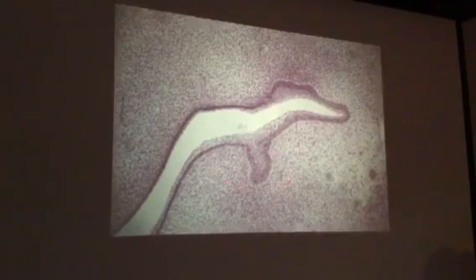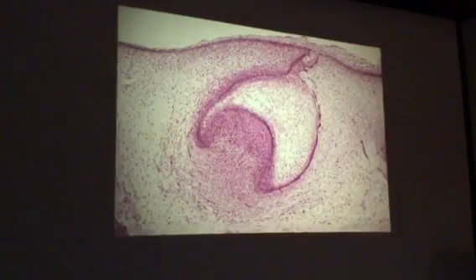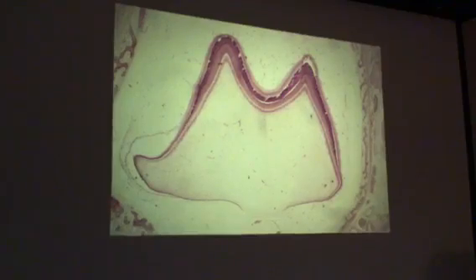Okay, that stage right there would be what? Tooth bud. And that would be what? Dental lamina. The rest of this tissue could be classified as what? Oral epithelium, specifically, it'd be ectoderm. Okay, and we have pretty much the same thing right there as the previous slide, and that one as well.